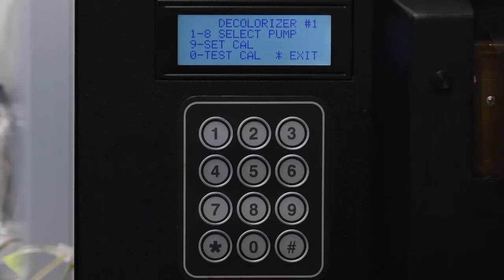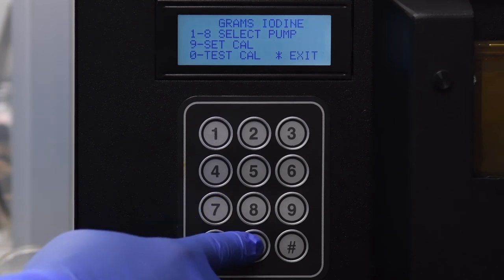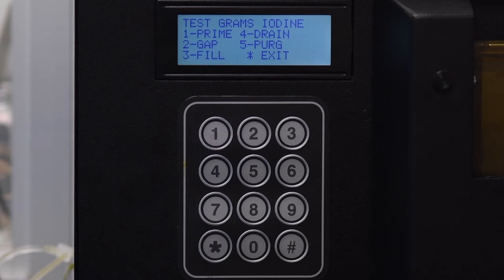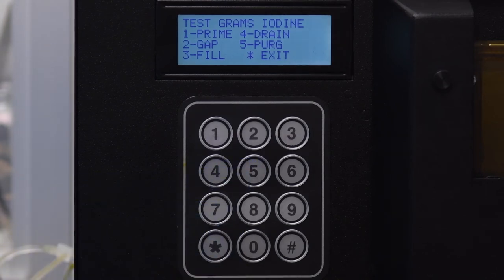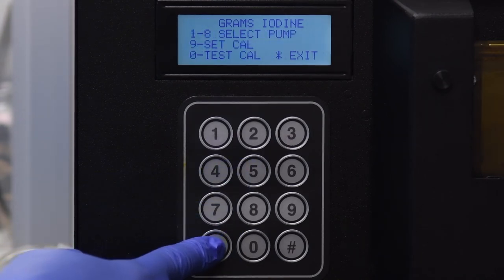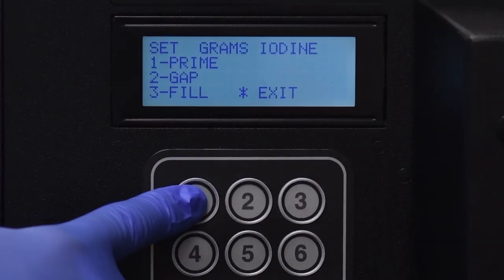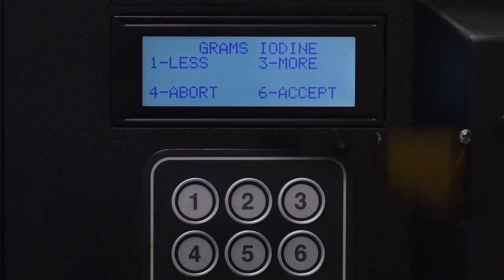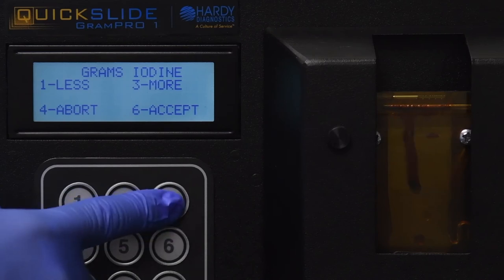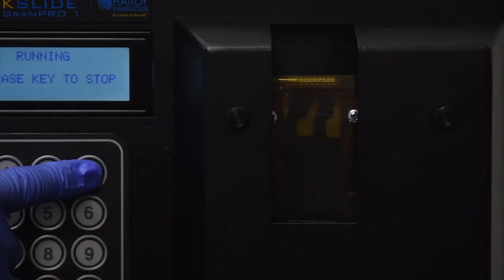Press 1 to select Set Fill Levels. Press 7 to change the top of the screen to say Grams Iodine. Press 0 to select Test Calibration. Press 4 to select Drain. Once the draining has completed, press 5 to select Purge. Press star to exit back one screen. Press 9 to select Set Calibration, press 1 to select Prime, press 1 again to select Interactive Setup.